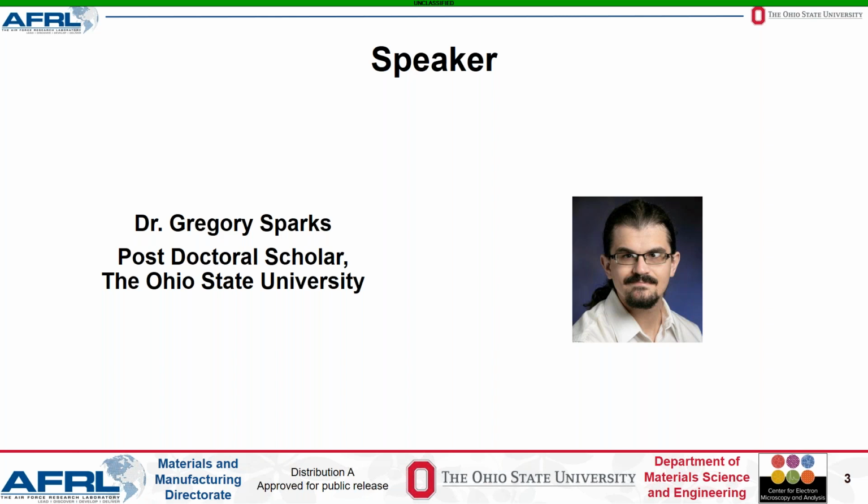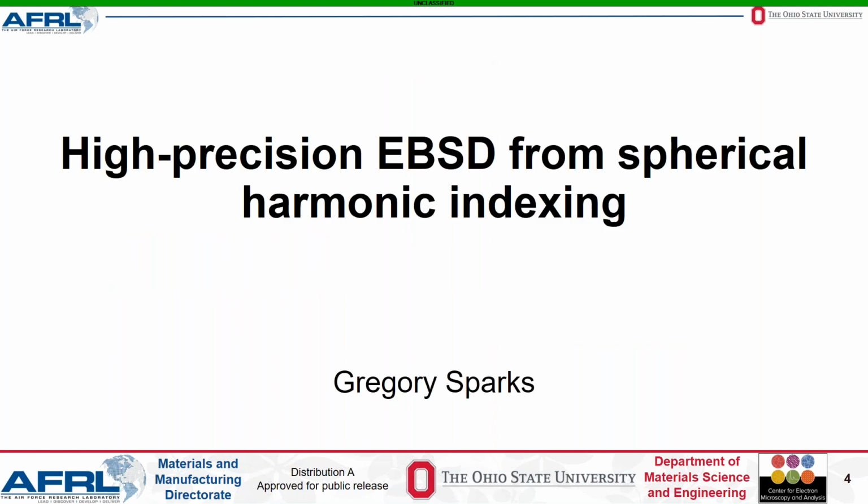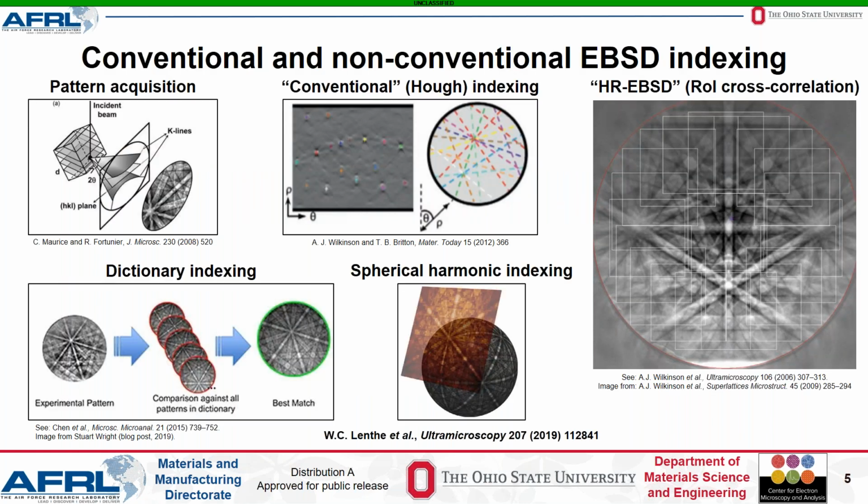All right, thanks for the introduction. Welcome to my presentation, High Precision EBSD from Spherical Harmonic Indexing. So first, I will give a brief overview of EBSD indexing techniques.